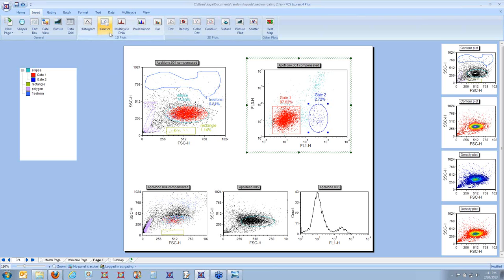Okay? In fact, you can even get a little more fancy with your gating strategy here from the gate view. And I'm going to now make gate 2 a child of my gate 1 simply by dragging it in. And now you see we have no royal blue events inside gate 2. But if I drag this over to gate 1 so that there's an overlapping region, you can see that the intersection of those two gates are now colored blue. Okay?